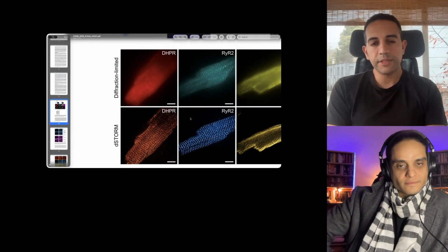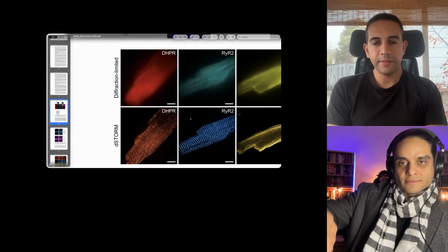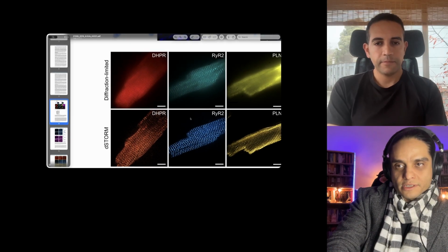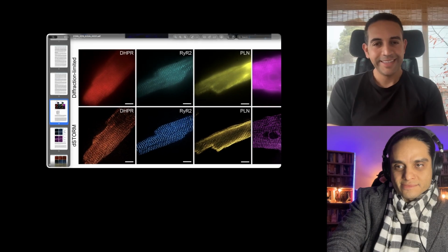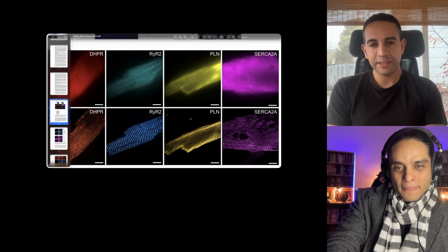So that was just the first thing that we showed here, is that we're able to really define nicely the sarcomeric structure of those cells. Really nice. So that was just a panel for the wow factor. And then eventually, you still have to do some quantification.